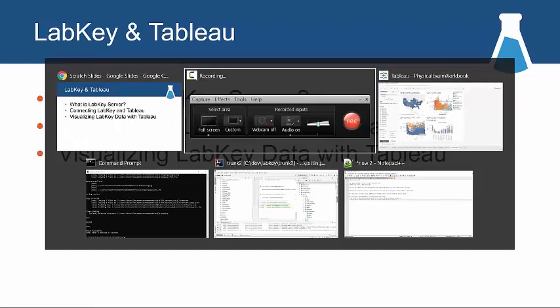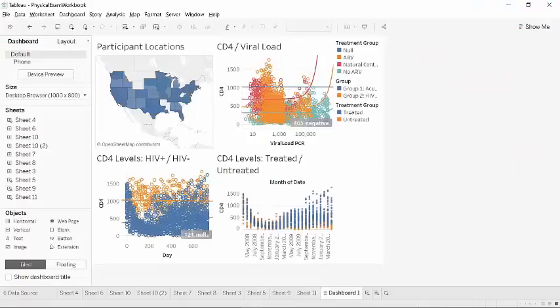Before I get started, actually, let's skip to the end. This is the actual dashboard, the final result of my work here. This represents different visualizations on a research study that I created inside of LabKey Server — a research study that involves HIV patients and their health and a number of their disease progression metrics. You can see that I have visualizations that show their health over time, visualizations that compare the healthy patients with the less healthy patients, and also a sense of their geographic distribution.